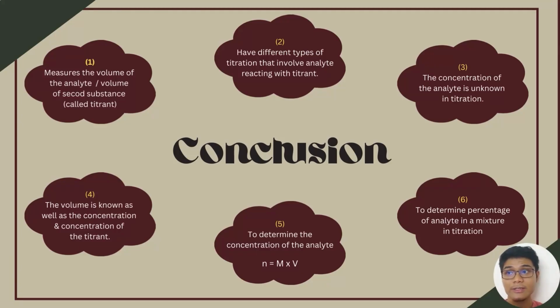Direct titration is a common method that is widely used in various applications worldwide. Despite the simplicity of the procedure, it plays a vital part in the world of chemistry as a method of determining the concentration of substances. While there are other more advanced methods, direct titration is by far the easiest and most cost-effective method of testing and execution, hence why it is used worldwide.